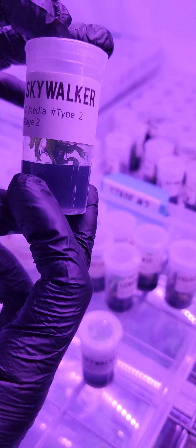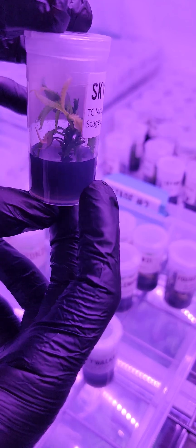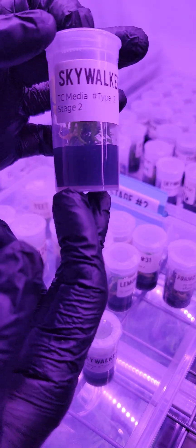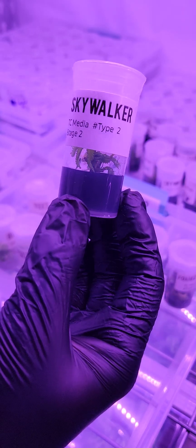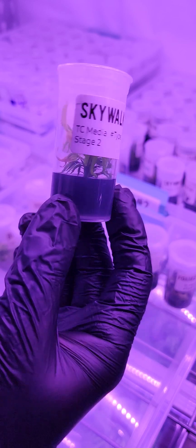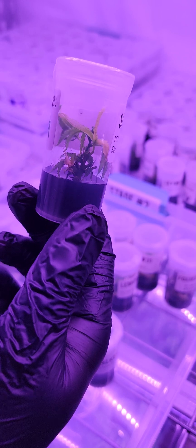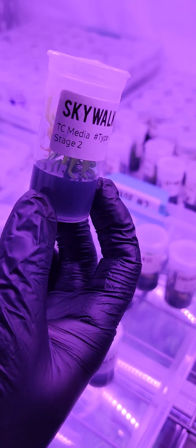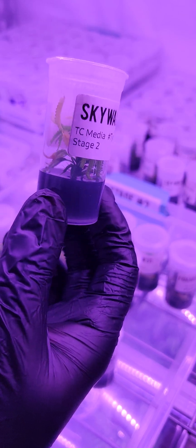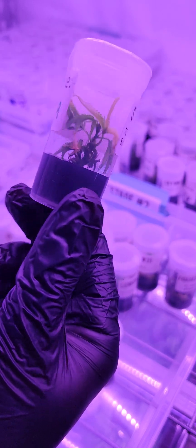The plant will effectively have been reset and supercharged with our specific media blend, which is designed to reinvigorate the genetics. It will have essentially the same vigor as this plant when it was first germinated — this is the very first time the Skywalker OG Kush was ever grown, sometime in the 90s or late 80s, who knows exactly. That's tissue culture for you.